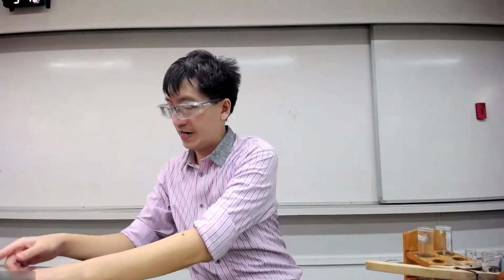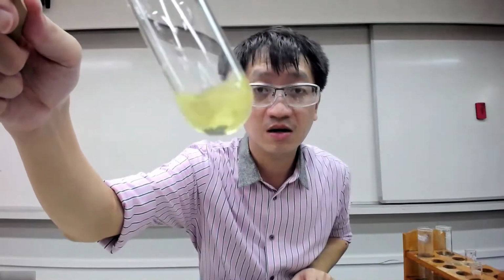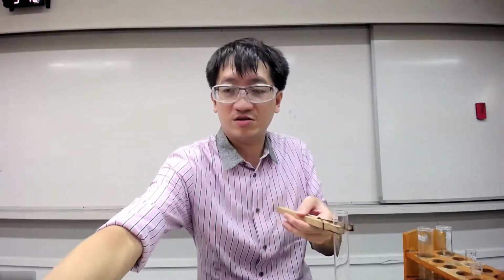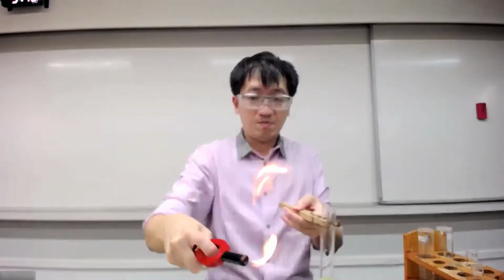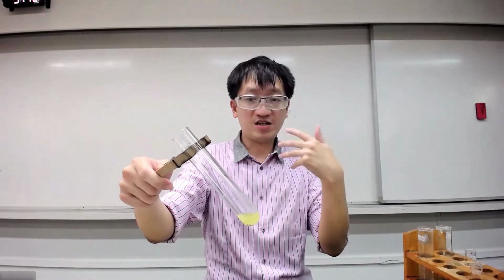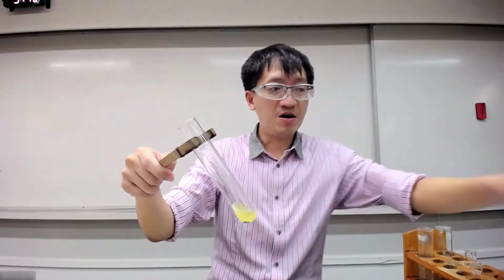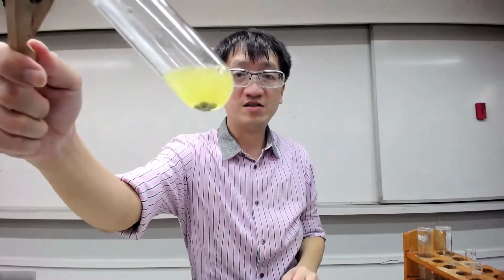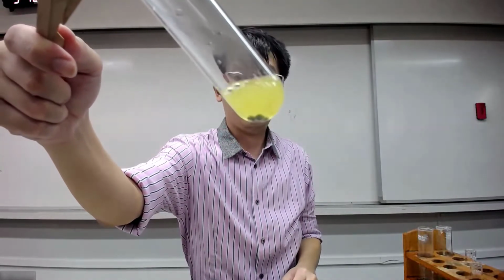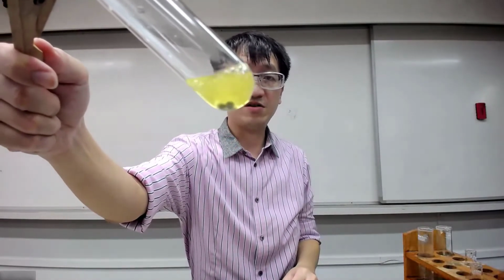You can observe that at the very beginning there is brief effervescence, just very brief. But you're asked to heat it, so I'm going to turn on the flame. Going to keep it for a while, just to give it slightly more energy, so that the effervescence becomes more vigorous. You can see now it's a lot more vigorous. Going to heat it a bit more. Now the effervescence is very vigorous.